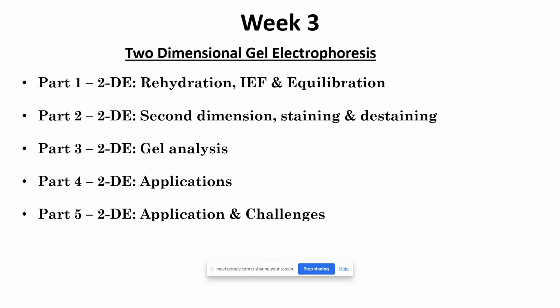There are different methods or techniques available for staining, which tell us about different sensitivities of detection. Once the proteins are run on the SDS-PAGE gel, in order to visualize them, we need to stain them, and the stains are of different types.